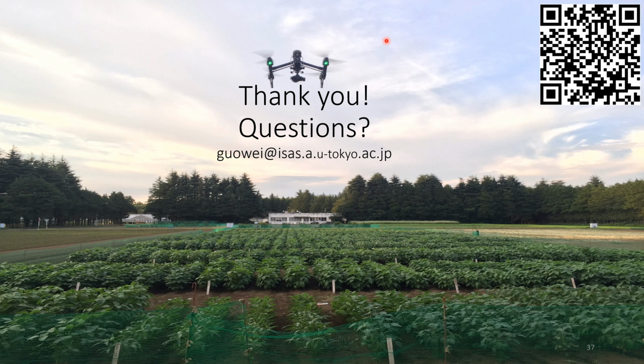And if you are familiar with Python, I would introduce you to OpenCV, so Python and OpenCV. And there's also another library, PlantCV, which is also very good to take a look at. And there are a lot more. So maybe you can just send me an email, and I can give you a couple of links to those libraries.